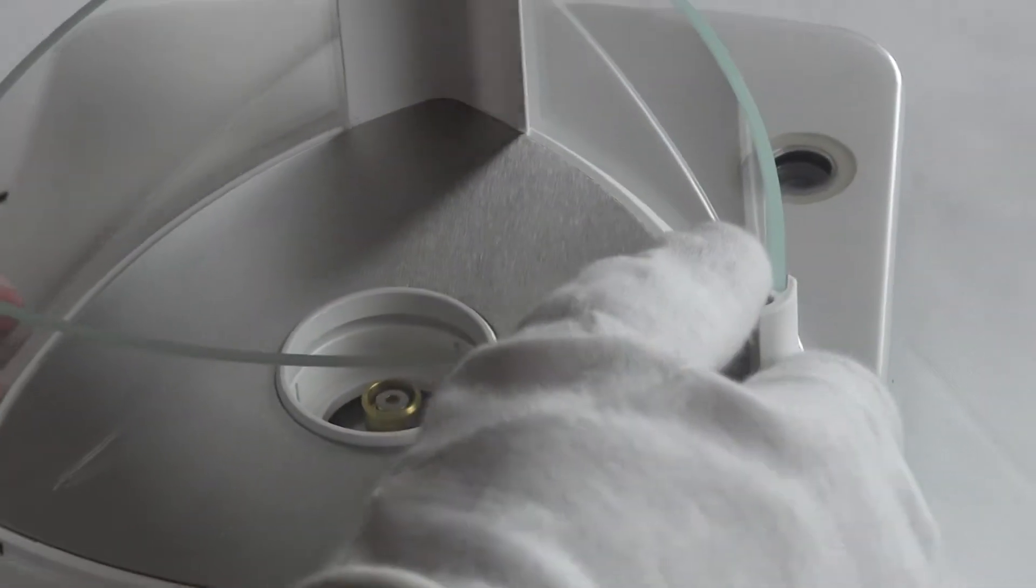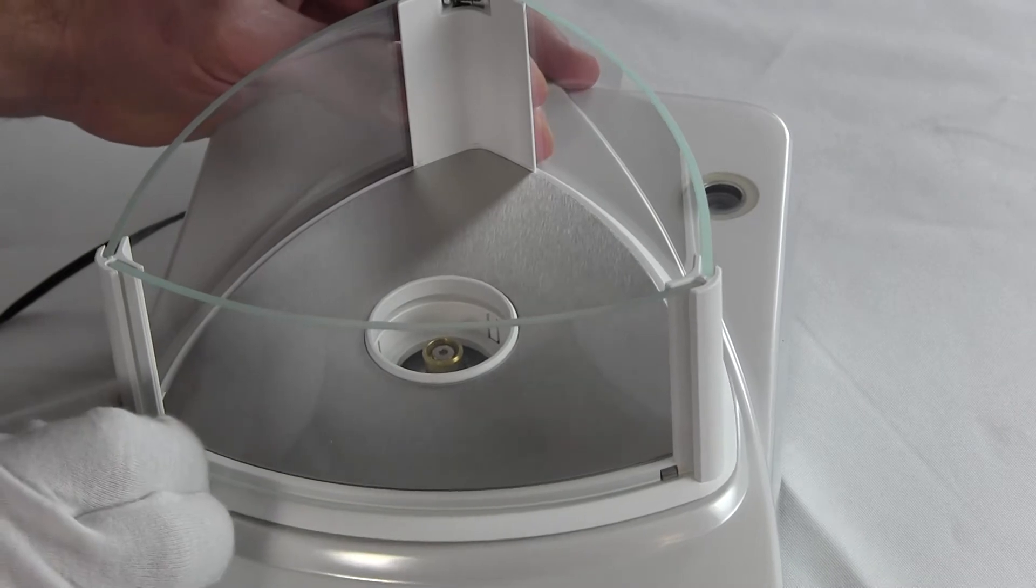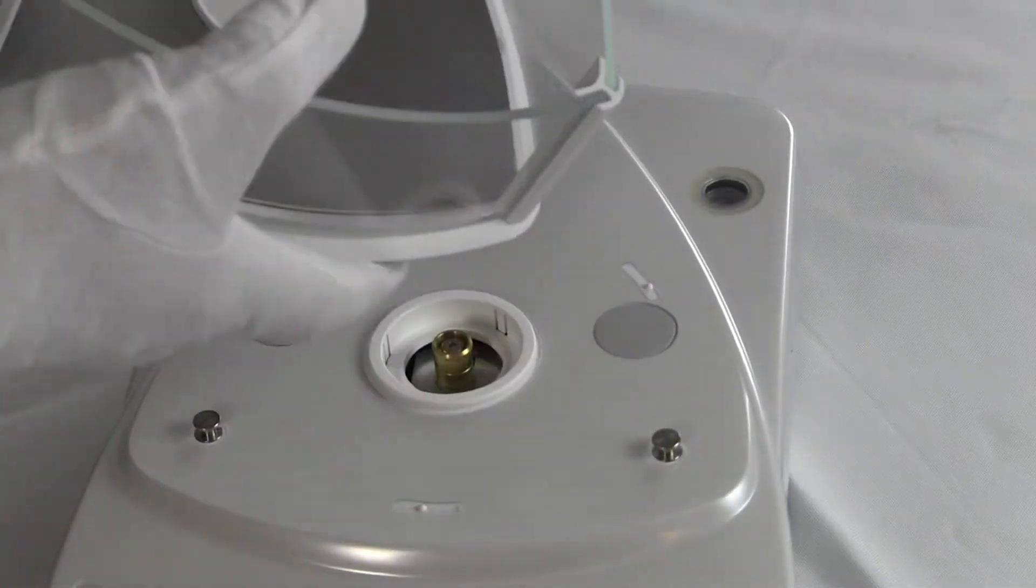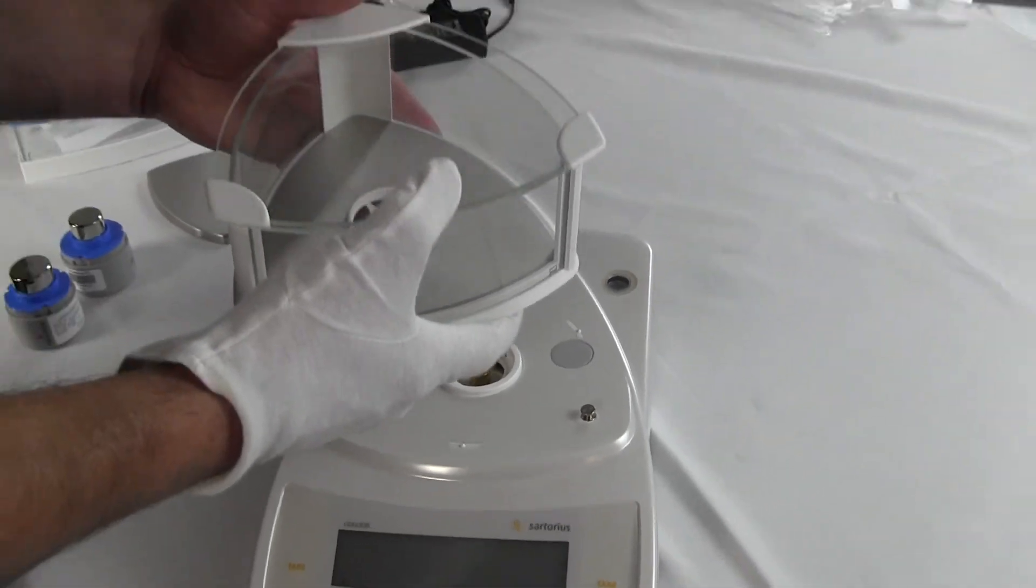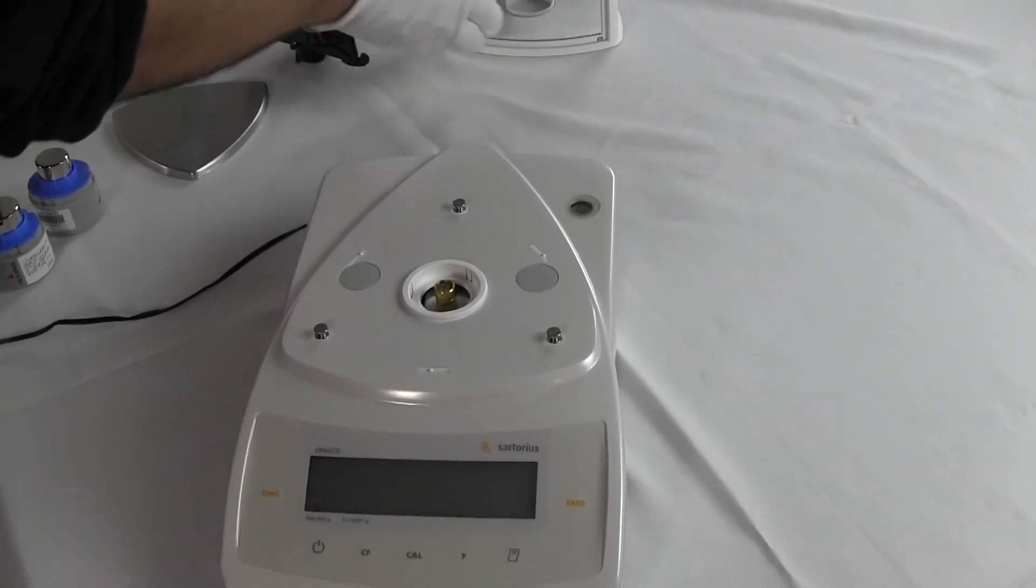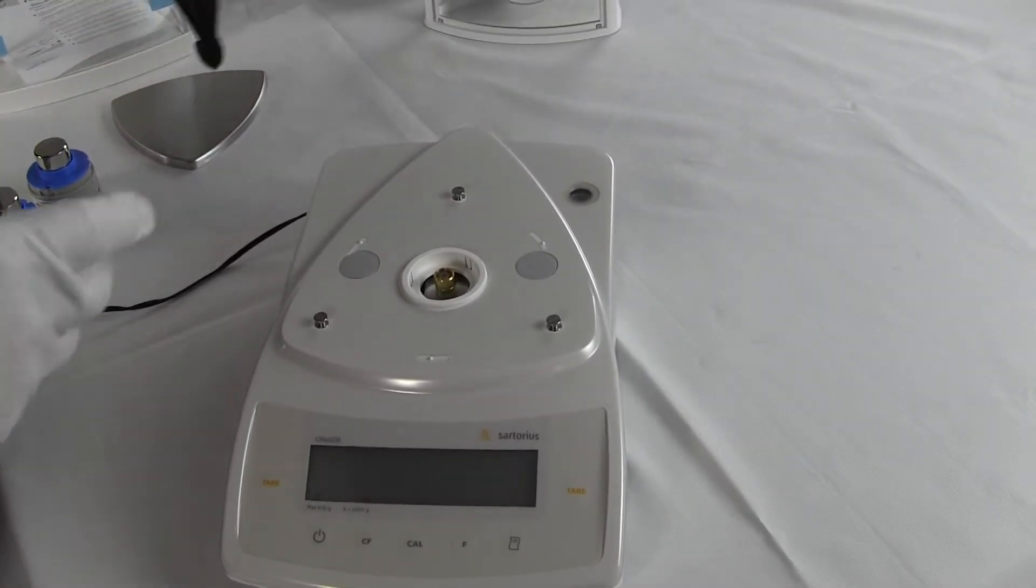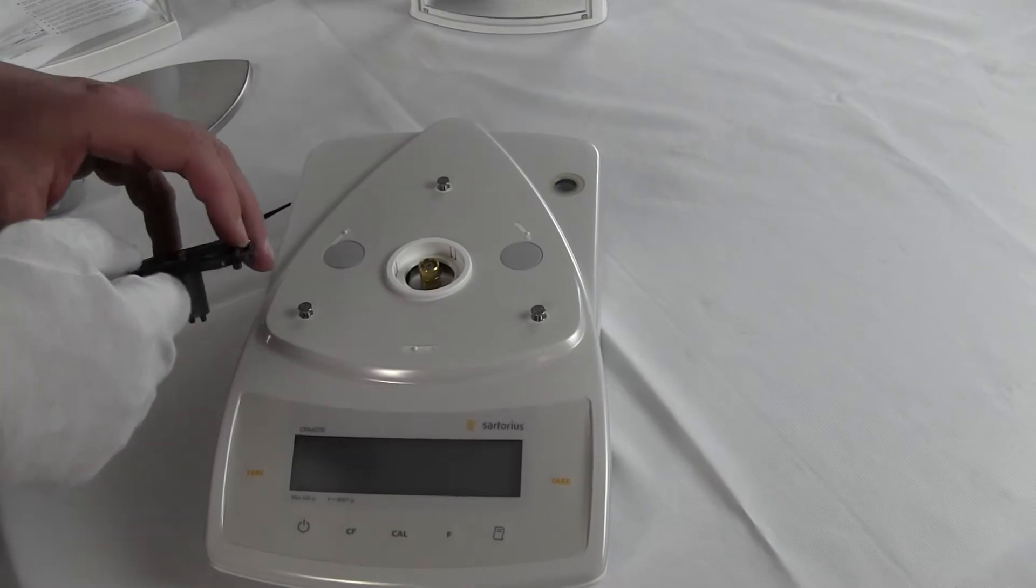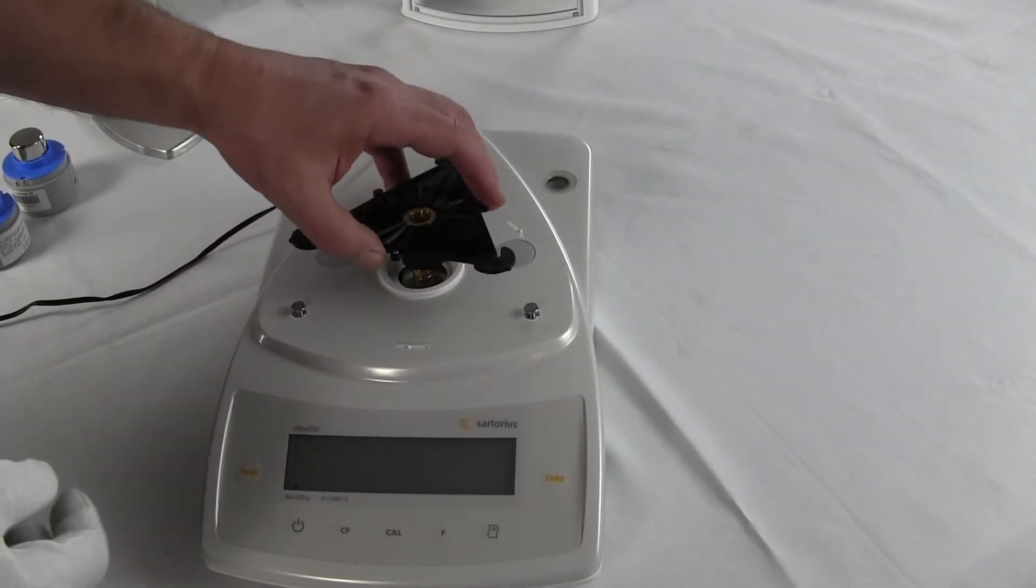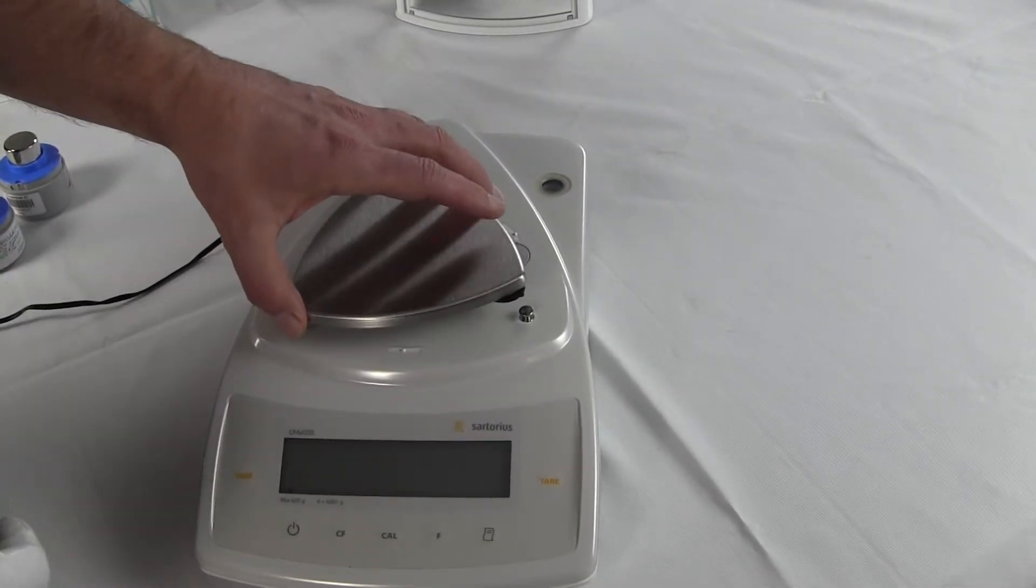Now on this draft shield, to disengage it, you need to turn the draft shield. And then the draft shield lifts right up. So this draft shield can be removed. And if the draft shield was in your way, say if you needed to weigh a large silicon wafer, like an 8-inch silicon wafer. If you had to, you could put this balance in a glove box and you could operate the balance by putting on the platform.